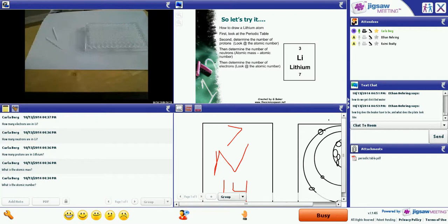Make sure you shake your chemicals. Okay, you want to be sure that everything gets shaken. Make sure your lid is on tight at the beginning of each and every step. So each and every step, you need to make sure you are shaking.